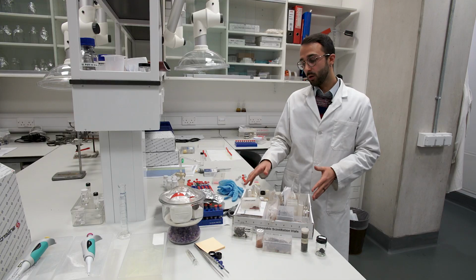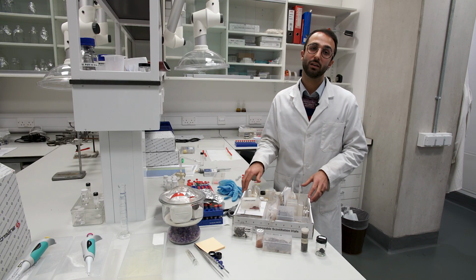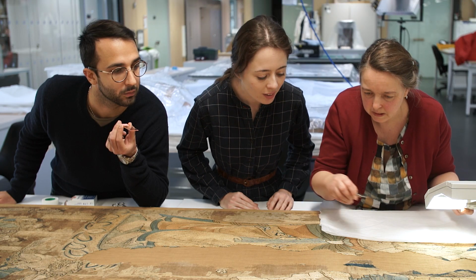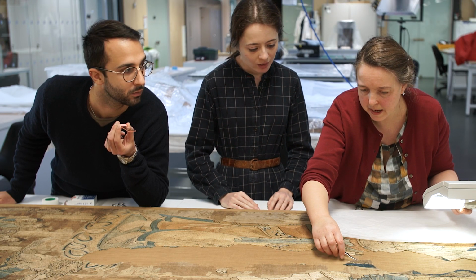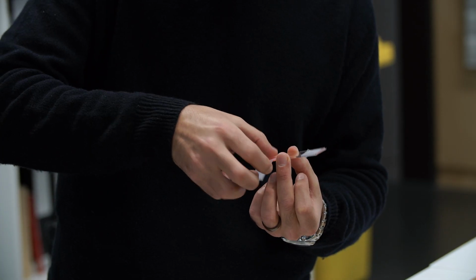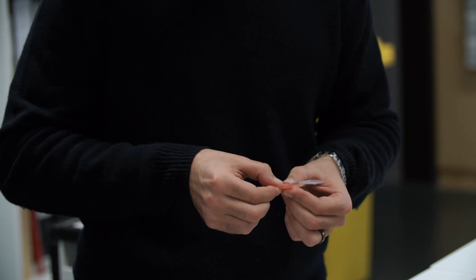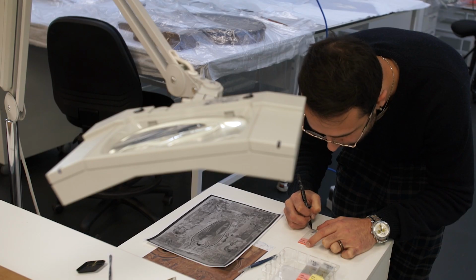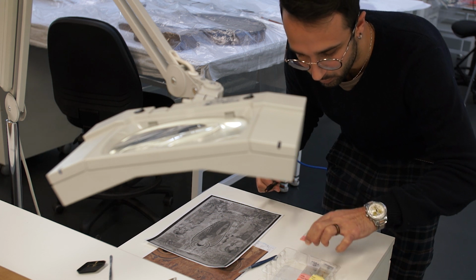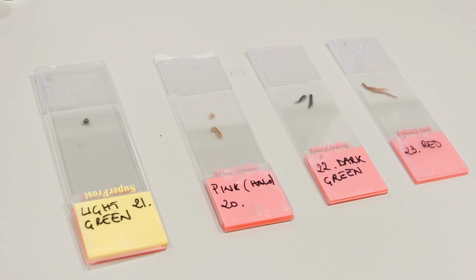Today I'm gonna work on some samples taken from a famous Chinese textile referred to as the Vulture Peak. I was with Monique and Hannah and we were sampling the textiles, and what we did was taking small amounts of fibers and we put them between two glass slides and labeled them.